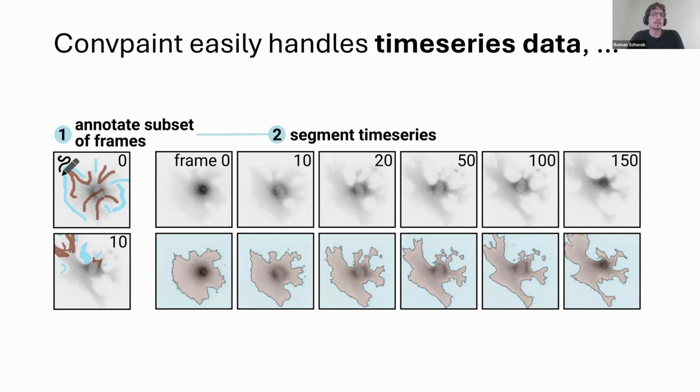So until now, we've only worked with the coins example, which was grayscale, and also with the camera example, which was a different type of image from the content, but it was still just a grayscale image, and both of them also just 2D. So in technical terms, those were both 2D arrays. And we've implemented Convpaint in a way that it can straightforwardly process also 3D data.